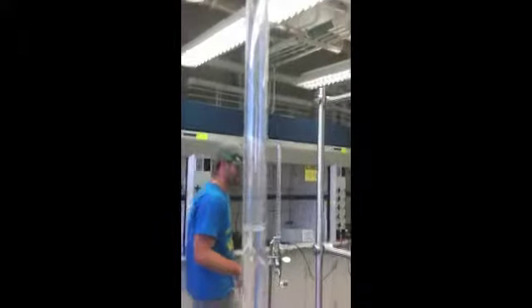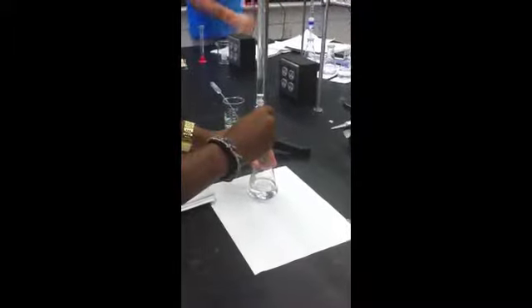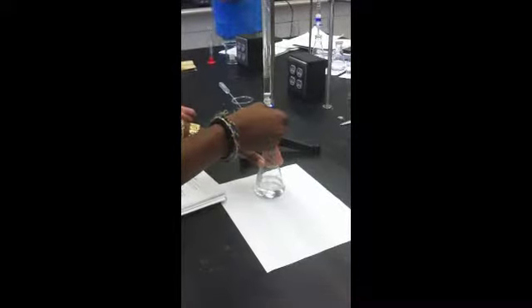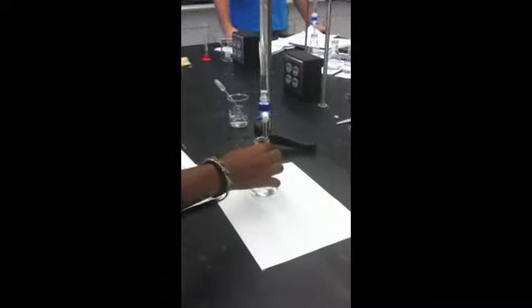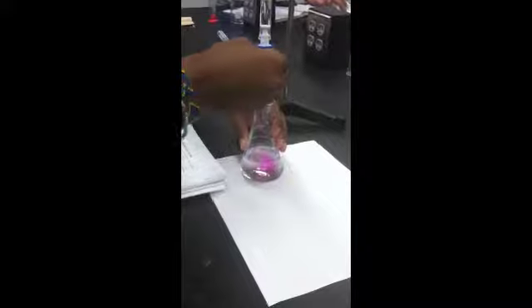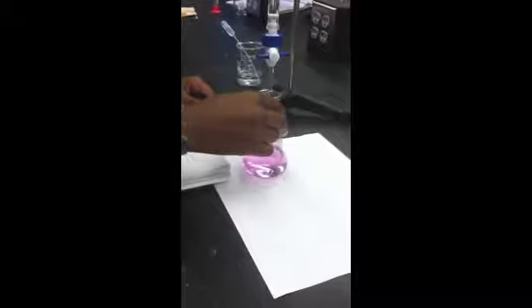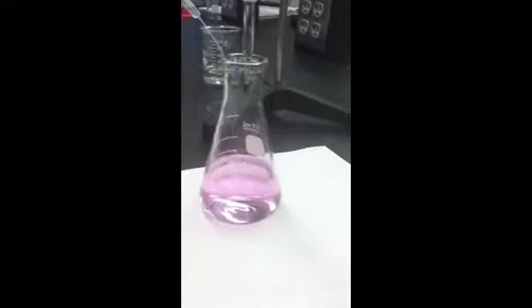Here's Brooke, starting with our initial. Now she is going to release some of the NaOH and gently swirl the flask. We used a white sheet of paper so that way the pink color would be easily identifiable, because in lab you said that we need to argue that it's pink, so we were really going for a really faint pink color, and so we decided in order to see that it would be best to use the white paper. And there's her light pink. Now she's going to record the final.